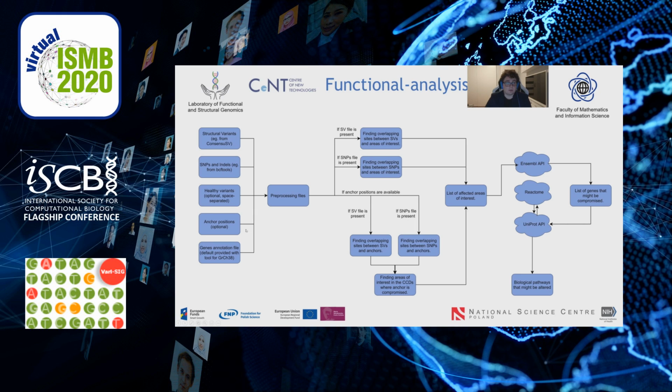Also, you can put as an input anchor positions as a result of ChIA-PET experiments. We also provide the genes annotation file, which is pretty much default, and it's provided for the newest reference genome.